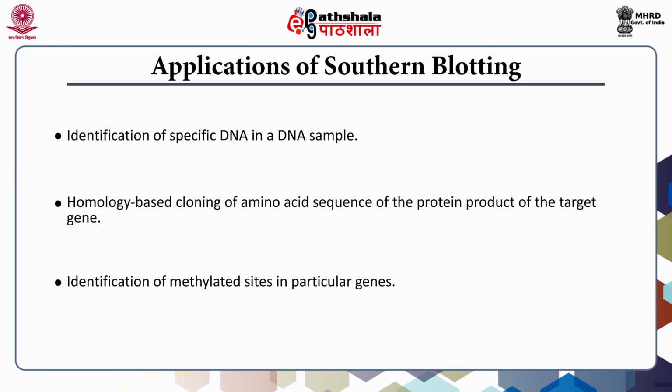But with the development of newer molecular biology methods, which include real-time PCR, the technique of Southern blotting is not much used now, but it has a historical significance when other techniques were not available, and this was the only technique which could be applied for identifying the gene of interest from a given DNA sample.